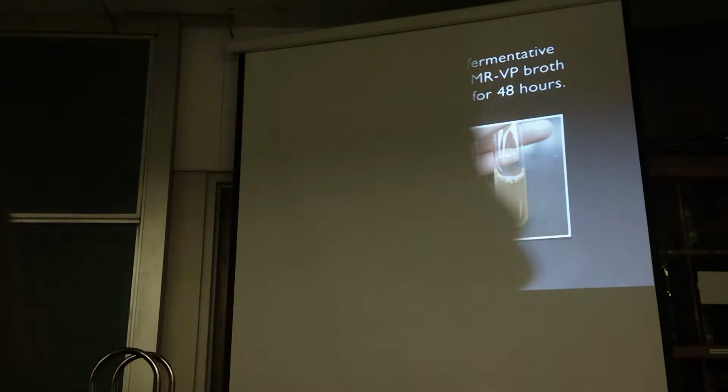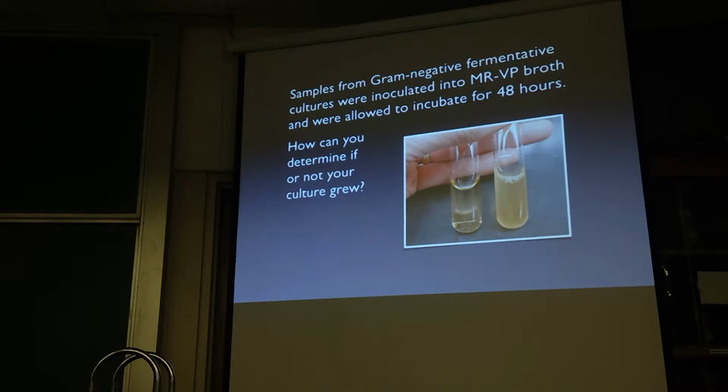Well, they may be sitting on the bottom, especially the staph cultures. Some of you had staph. Oh, there it is. Please don't tip that tube, Justin. Keep it vertical. You're scaring me back there. Yeah, be careful with these. Your culture may be on the bottom, but don't shake them. They leak. Okay, turbidity indicates growth.